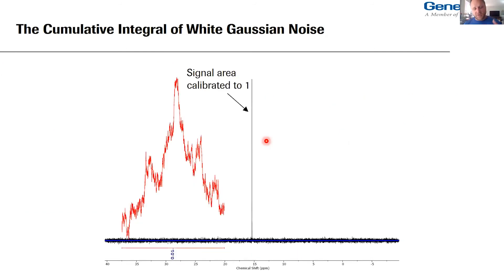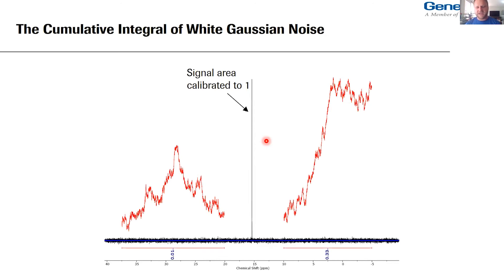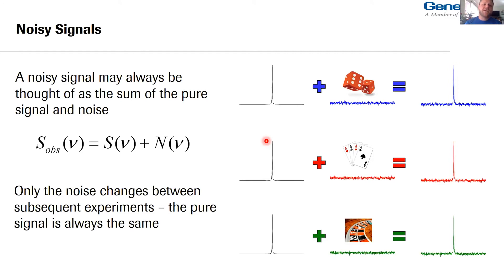Going back to the experimental data: if we try to be clever and integrate just the noise, excluding the signal — remember I calibrated the original integral of the signal to one — the integral of noise is zero as expected. But there's a positive contribution of about 18% of the original signal area, and a negative contribution of about 16%. On the other side of the noise strip, there's a contribution of 33% of the available signal area. There's no actual signal contributing to these regions — this is all coming from noise.